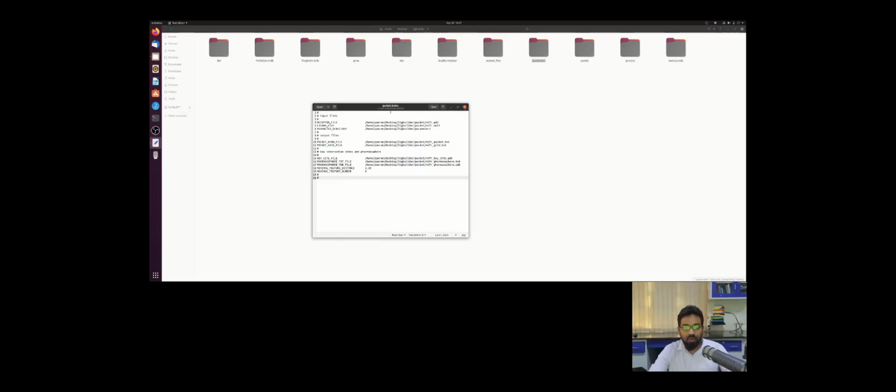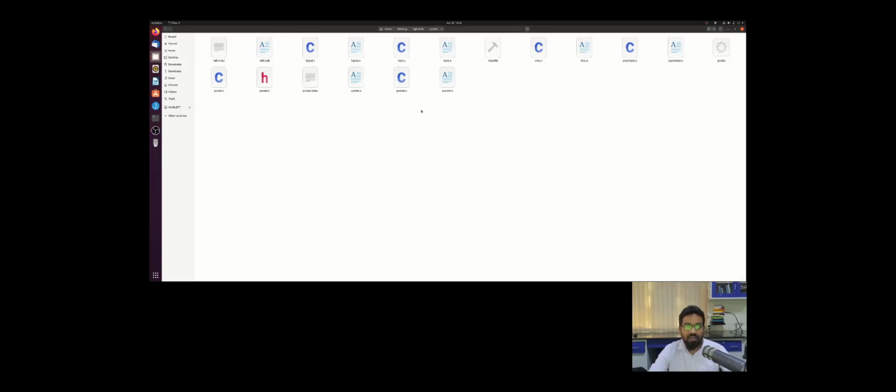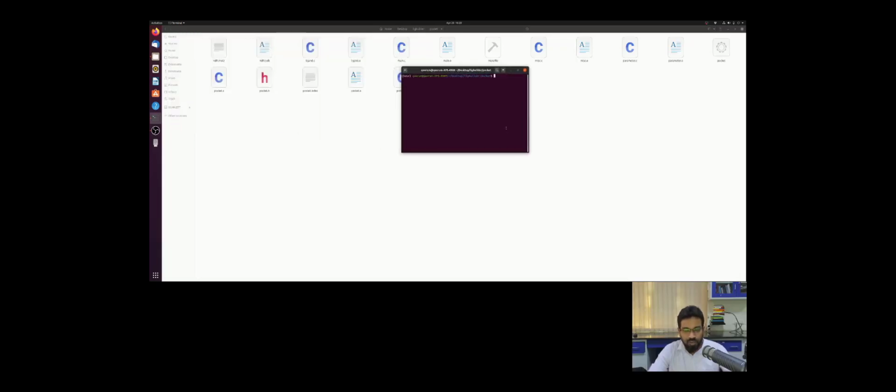We are ready for running pocket.index with the help of pocket. For running the program, the first thing is to go to the folder where you have the input files, 4dfr.pdb and 4dfr.mol2. Inside the folder, I am going to open a terminal. I have opened the terminal. I am going to give dir to see the various files present within the folder, to ensure that the input files and the program are present.